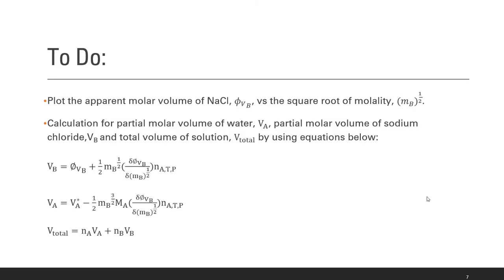Now what you have to do is, with those data, plot the apparent molar volume of NaCl versus the square root of molality. From there, calculate the partial molar volume of water, the partial molar volume of sodium chloride, and also the total volume of the solution.